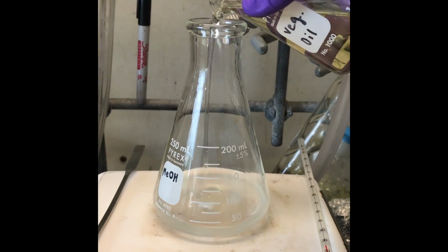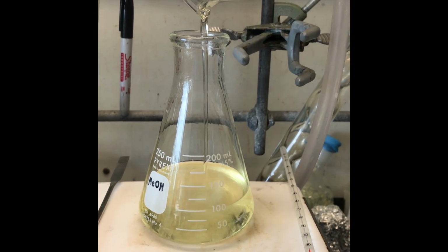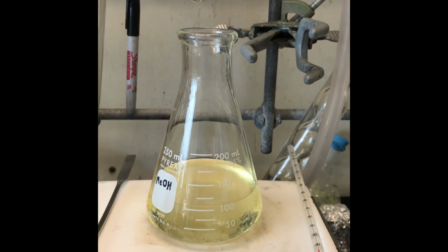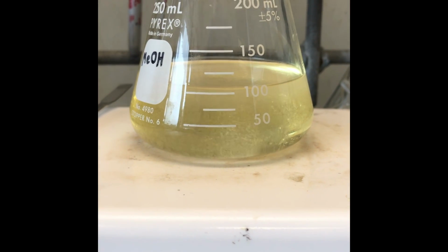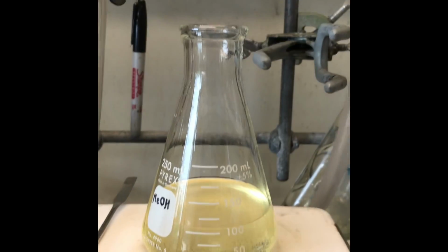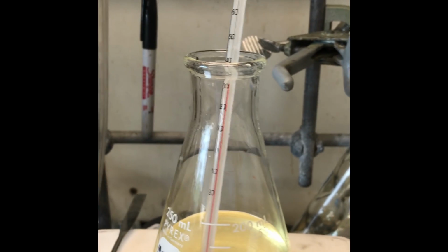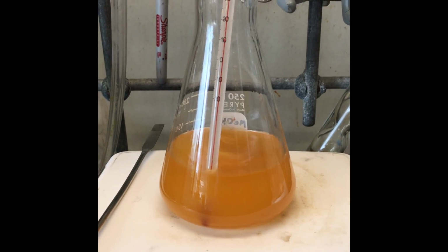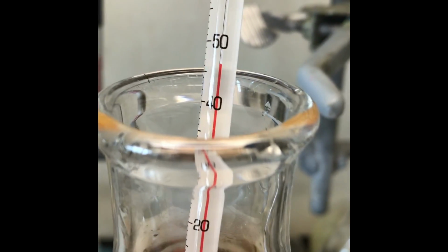Then, vegetable oil is added to a stirring solution of methanol and sodium hydroxide. The mixture is allowed to stir at 50 degrees Celsius for 30 minutes.